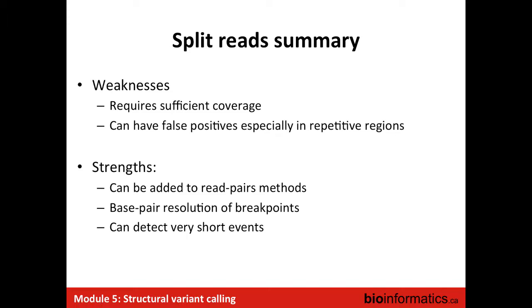So the summary of the split read strengths and weaknesses. In terms of strengths, it works really well in pair with the read pair method. It gives you the best base pair resolution, and it can detect really short insertions that you cannot detect in paired end mapping. If you have a really short insertion or deletion, in read pair you will be under the standard deviation, so split read can give you a better resolution. Weaknesses, a lot more: it needs more coverage than what you have in read pair, and there are a lot of false positives.